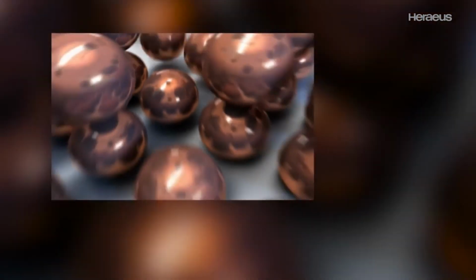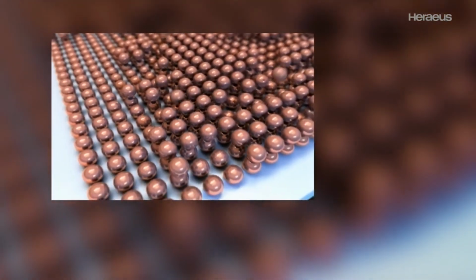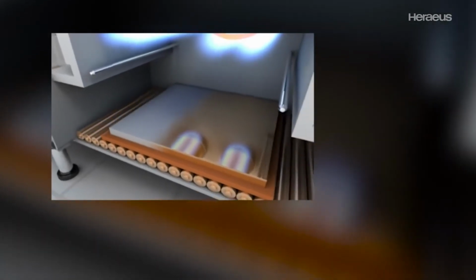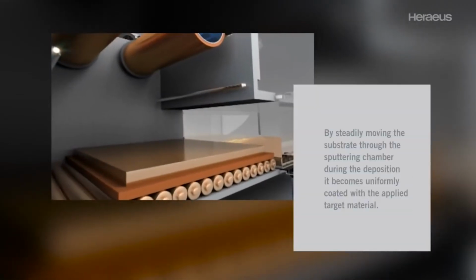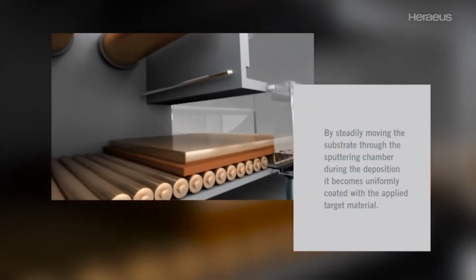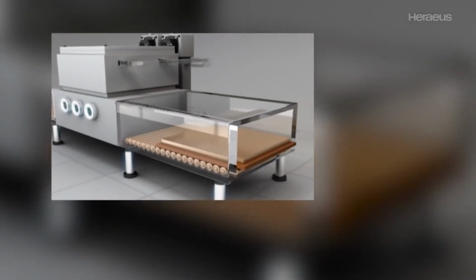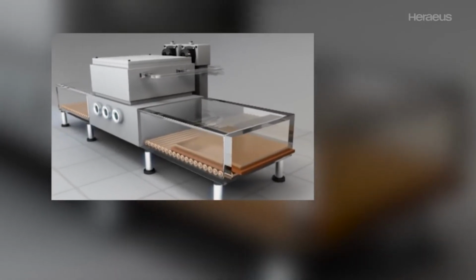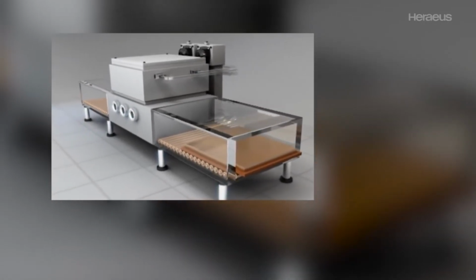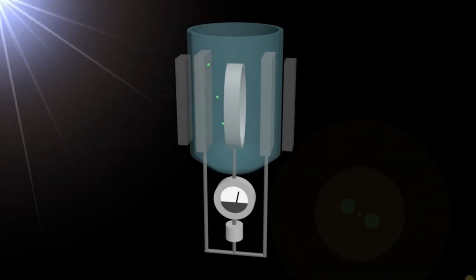You can see that at different angles the target atoms go down onto the surface of the thin layers of the substrates, and then the substrate moves steadily through the sputtering chambers and results in a uniform coating of the applied target materials as a sputter-cleaned surface. So in this process, we can say that it is the cleaning of a solid surface in a vacuum by physical sputtering of the surface using the Heraeus sputtering targets.